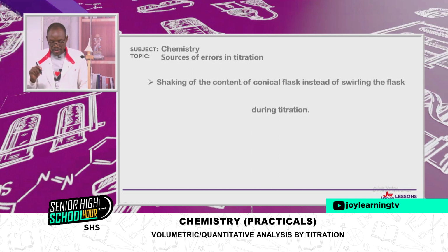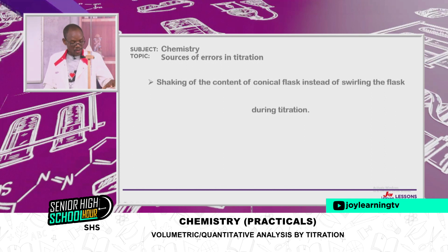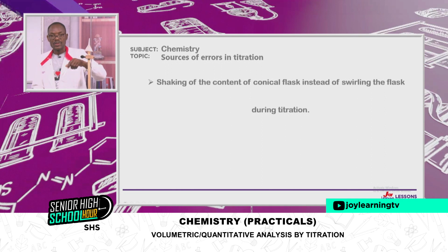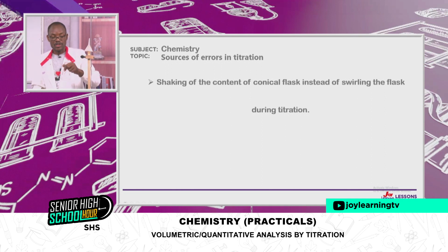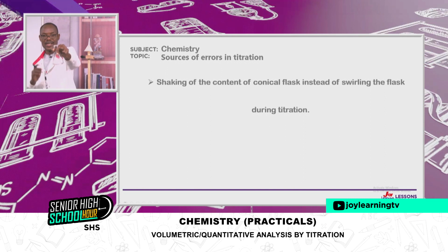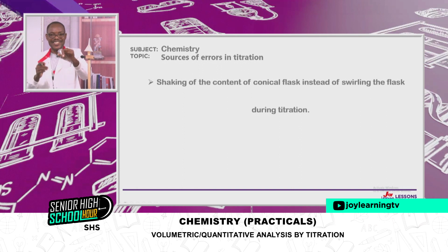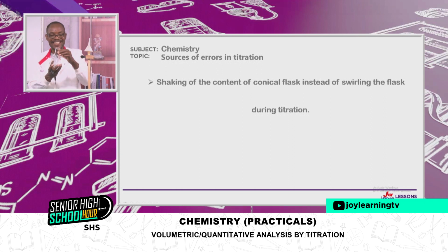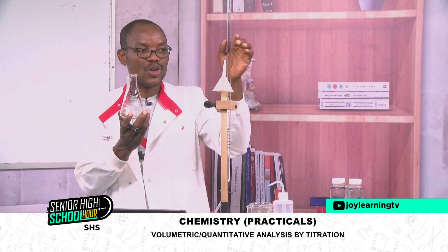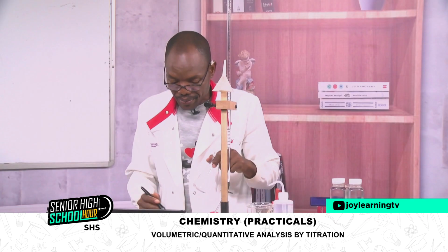Shaking of the content of the conical flask instead of swirling the flask during titration. So you swirl like that, then you will be shaking like that. Yeah, shaking. So it can affect when some of the solution jumps out, so to say, out of the conical flask. It means that the volume you pipetted earlier will be less, and that will also affect the endpoint value.